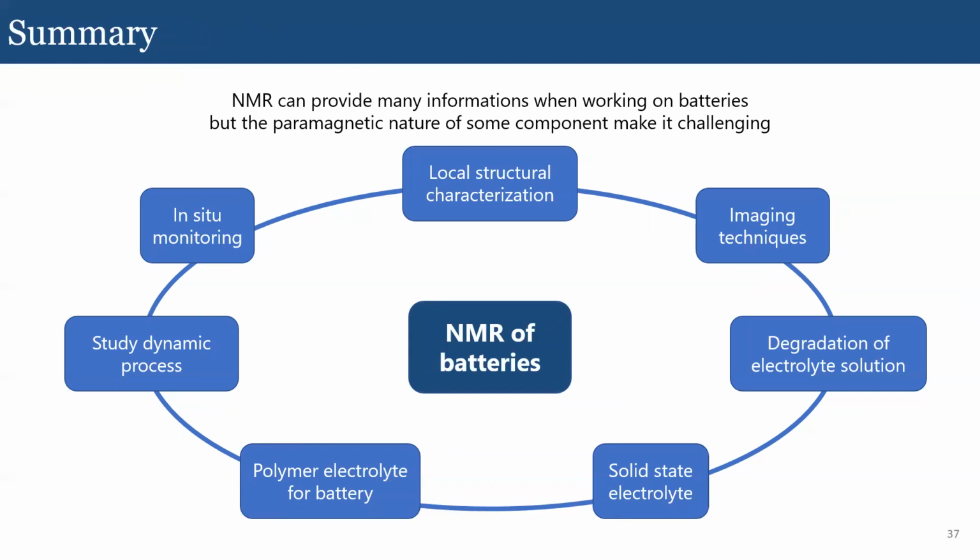And one thing to know is that these methods are always improving. Because of that, I would highly encourage you to reach out to NMR spectroscopists if you want to obtain particular information for your system, as they might have some new experiment that would be the best suited candidate for your type of application. And in fact, this is more general, but you can do that with any kind of technique. It's always a good idea to talk to people that have more knowledge about a particular type of technique.